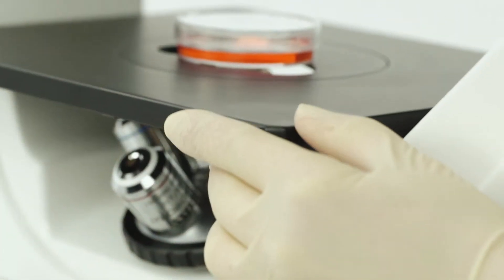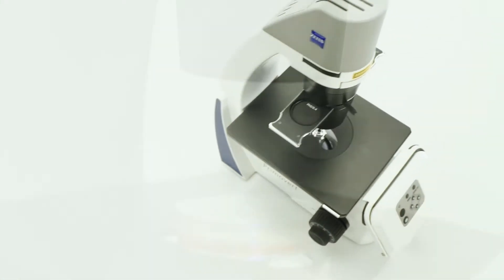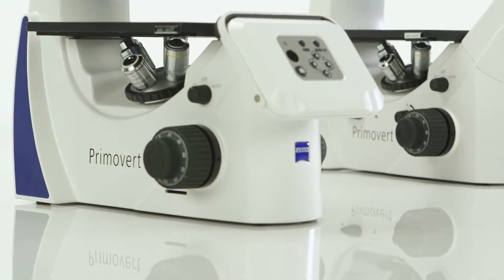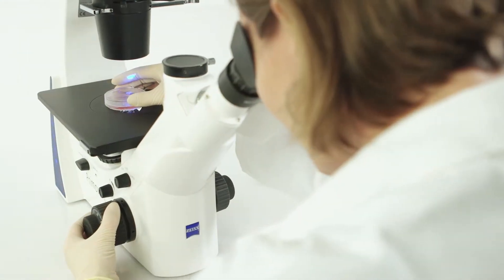It's easy to use, fits directly into your laminar flow box, and it lets you view unstained cells using phase contrast.